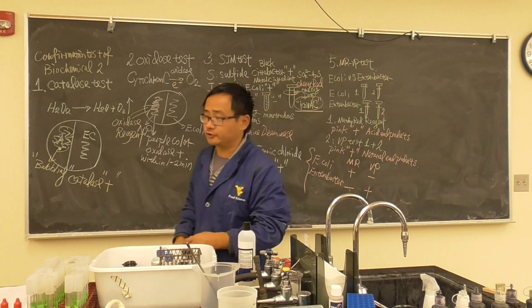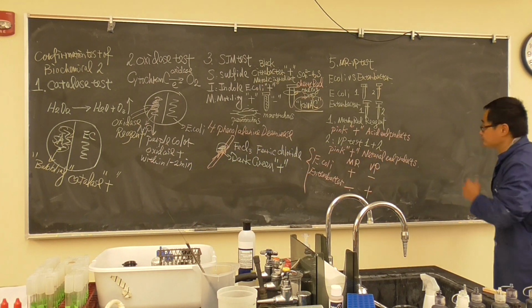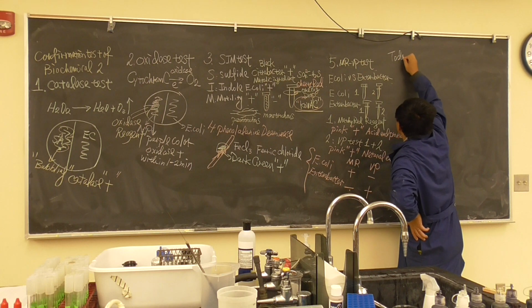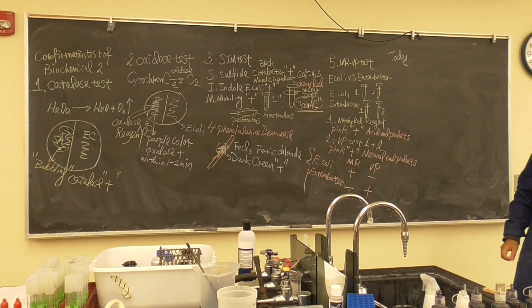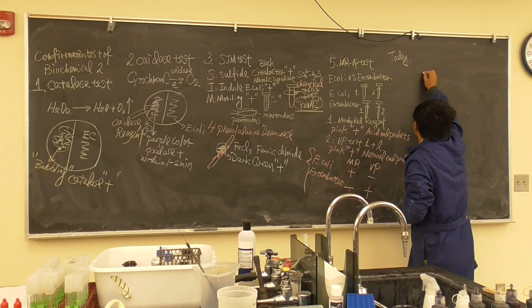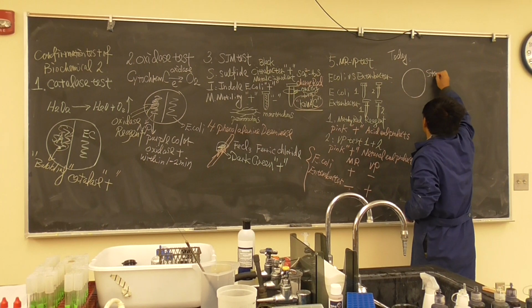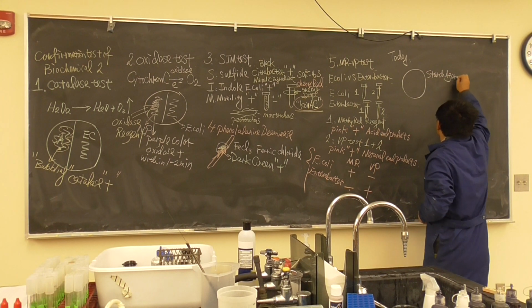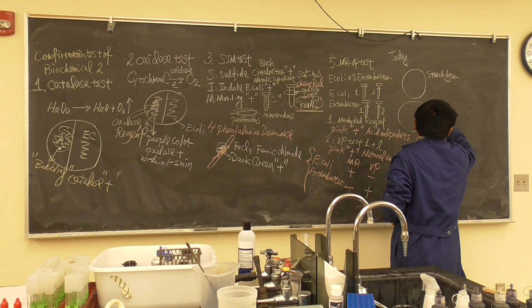Okay, we're gonna move on to today's lab. What is that? It's so simple. Okay, today's work. Everybody will grab 3 plates. Number 1, starch agar. Number 2, skim milk agar.